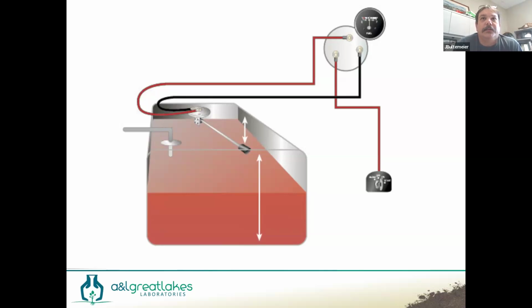The same thing with a soil test. So I mentioned Mehlich 3 multiple times. That is sort of evolving as the universal industry extractant. It is called the universal extractant because it pulls out all the nutrients. But we know from research at university, from industry, that if I have a soil test level below a particular number, there's a good likelihood I'm going to get a response to fertilizer. If I'm above that given number, the response potential for fertilizer is very low.